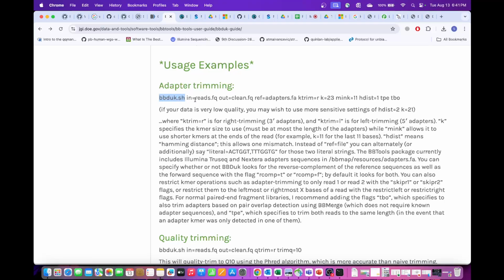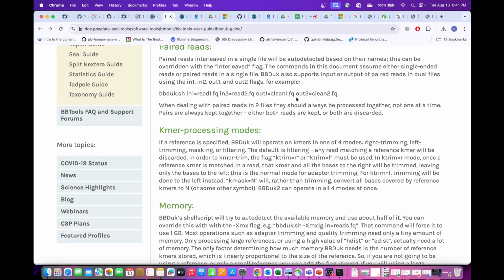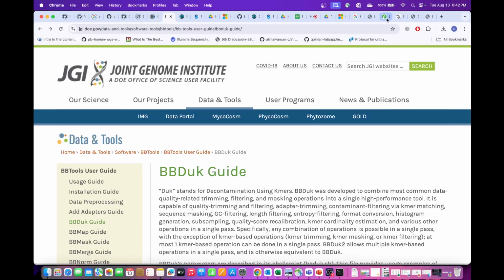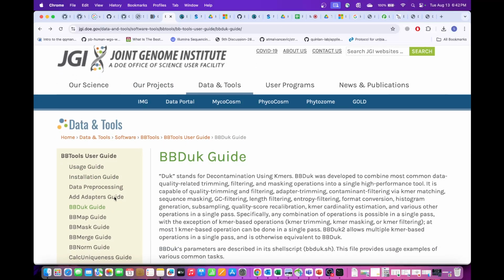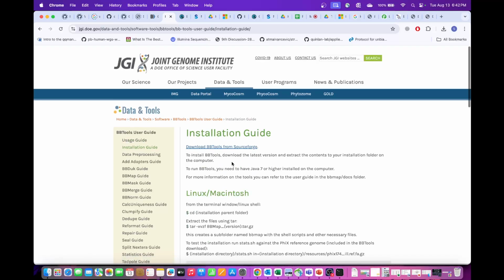So you go in the software, you give the input as your read file, your output as whatever name you want to give. You want to give the reference adapters. So for adapters, you want to know the sequence of the adapter to remove it. So inside the folder, let me actually download and show you what's inside the folder at least.